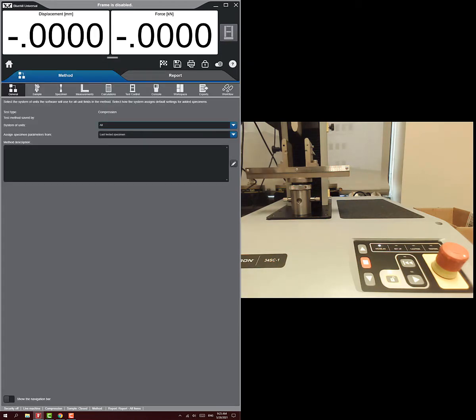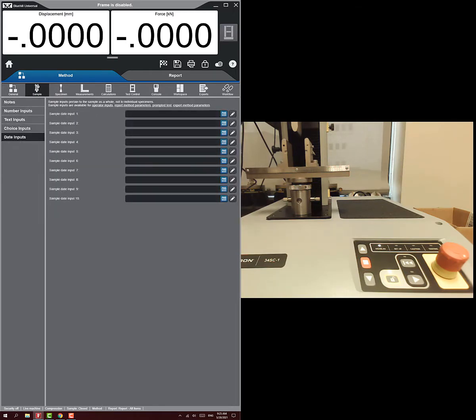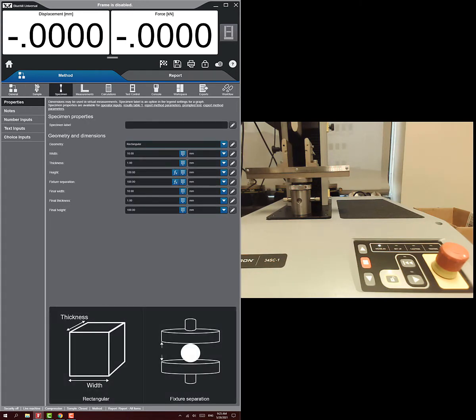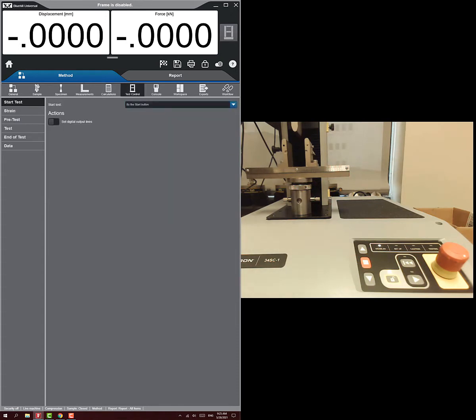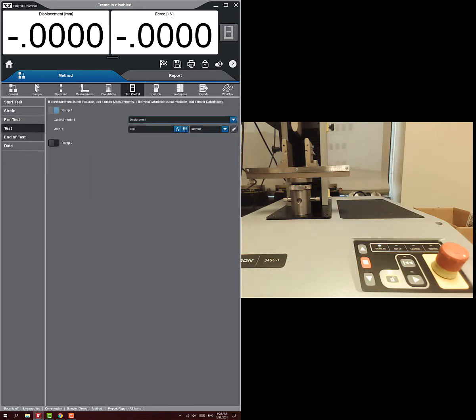A lot of these settings on the general tab just don't matter — we don't need to describe our sample, we don't need inputs, specimen settings, or pre-calculations. What we are going to focus on is our test control, specifically the test and end of test sections.